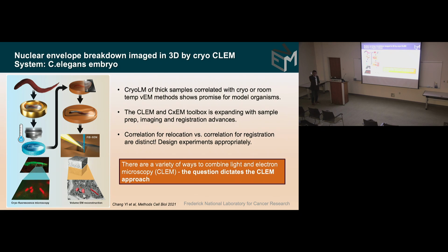Unlike C. elegans, where it is very, very difficult to get a massive number of cells to be perfectly fixed, with the Drosophila we dissected out multiple spermatocytes, and our collaborator just put dozens of them in agarose, fixed them, and then we only picked the ones that happened to be fixed at the right place. So we brute forced it a little bit.